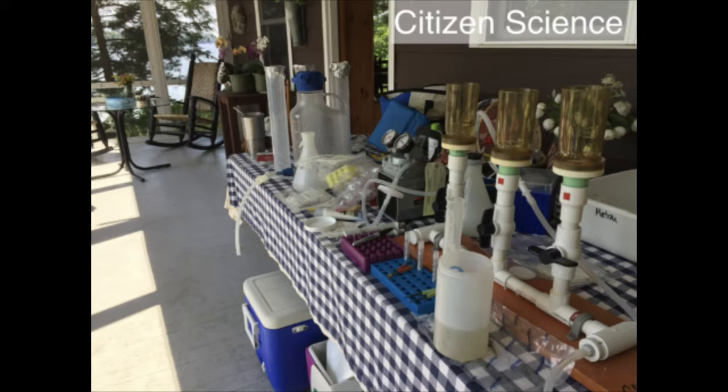We've started doing some cyanotoxin measurements, and I'll just point out that these are natural abundance cyanobacterial samples from Sabattis. We detected 0.62 micrograms per liter of microcystin. Remember, the World Health Organization limit is 1. So we're getting close to the WHO limit at Sabattis.